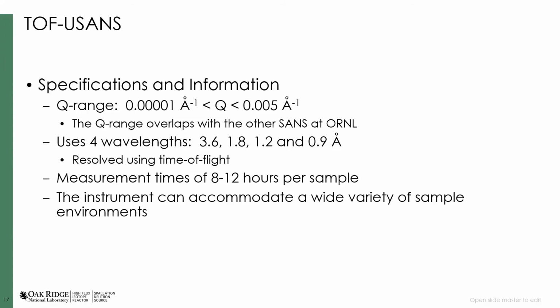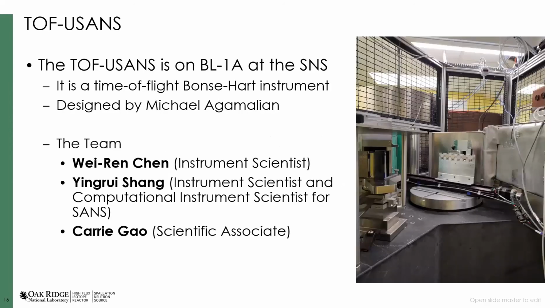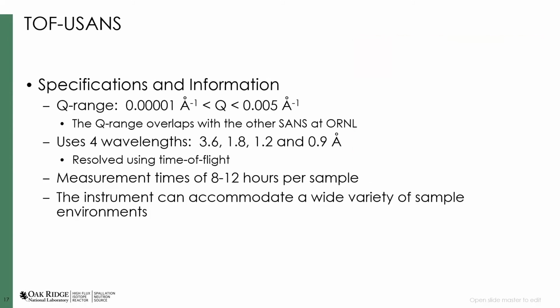It actually has the ability to accommodate a fairly wide variety of sample environments. Probably the biggest challenge you have is that the instrument itself is not terribly large. So you can see the entire instrument here mostly, and you do have some limitations, but things like furnaces, cryostats, the rheometer still fit in that space, and you can use them for doing your experiments.